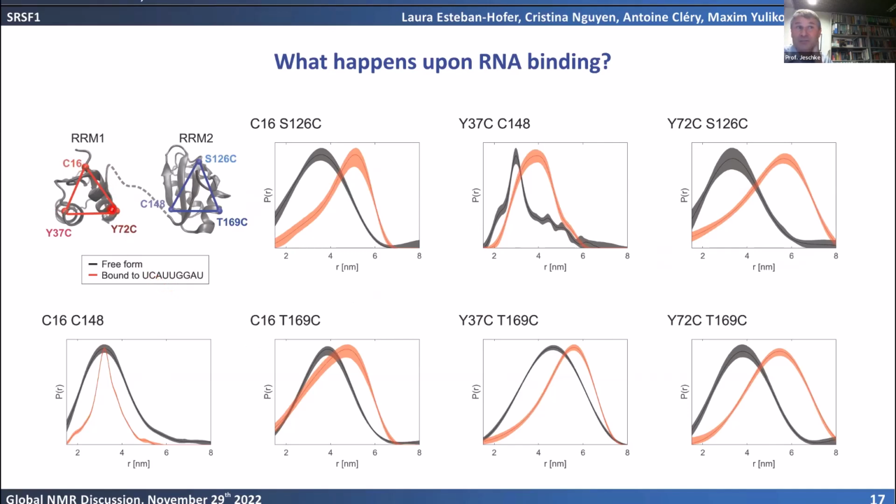Here are the reference points for this rigid part. So three labeling positions on each protein. So these tyrosines we can also use, we have mutated them anyway, we can also use them as labeling positions. And this is a native cysteine, which we mutate out if we don't want to label here, and otherwise we use it. This is the second native cysteine. This is the pair which I showed you before. And these are two residues that we mutate in RRM2.